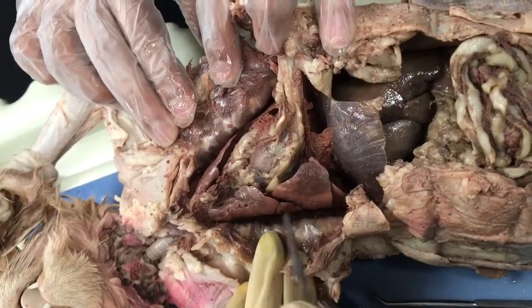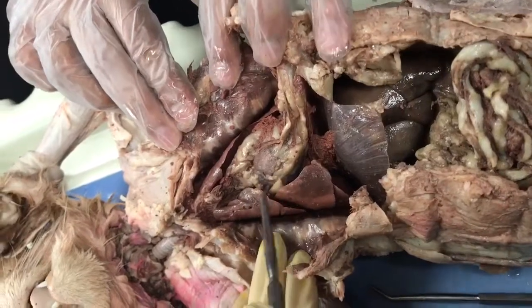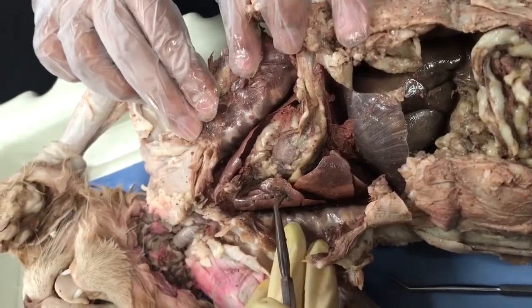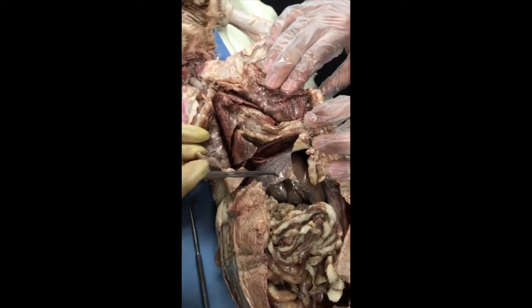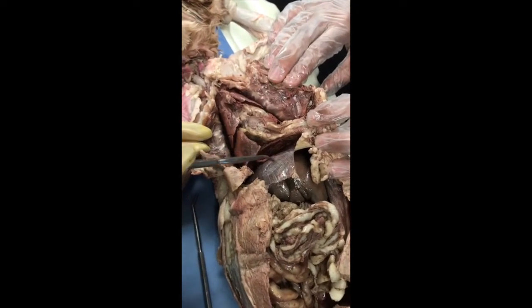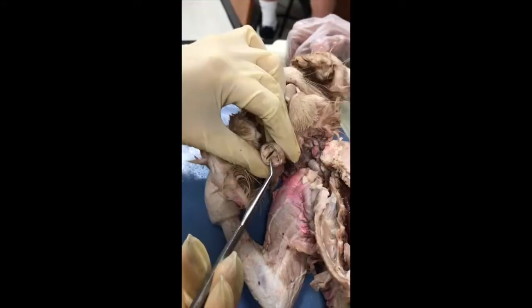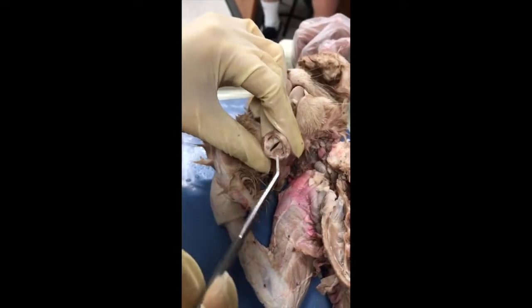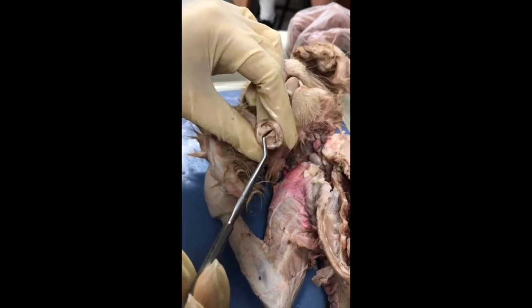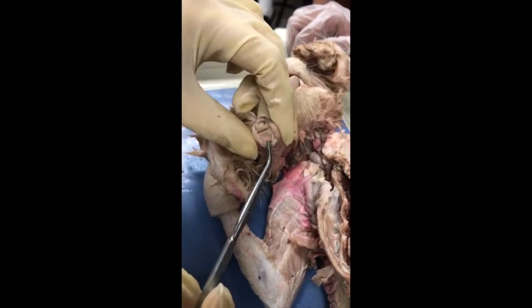These are the lungs. They are lateral to the heart, and their function is to bring oxygen to the bloodstream. This is the diaphragm. It's inferior to the heart and the lungs, and its function is inhalation and exhalation. This is the vocal fold. Its function is to produce sound, and it is superior to the trachea.